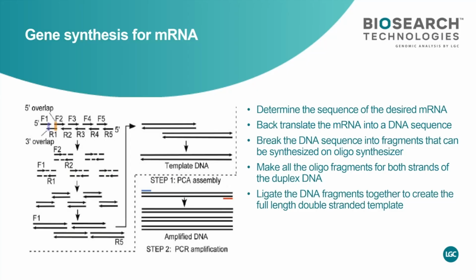Okay, gene synthesis. It is applicable in many fields right now. The most talked about one right now is gene synthesis as a template for the mRNA. However, this is something more current, but gene synthesis has a very long history and quite interesting development.